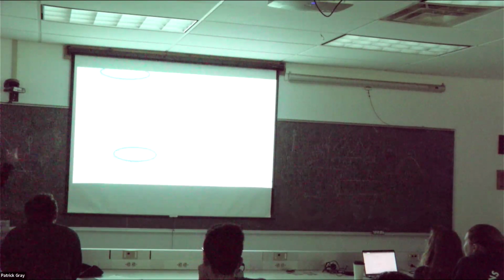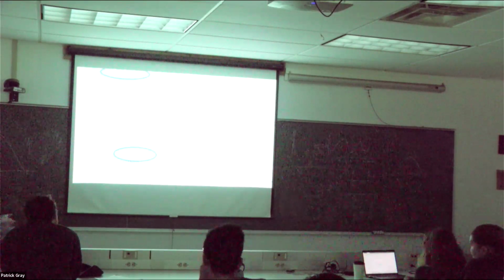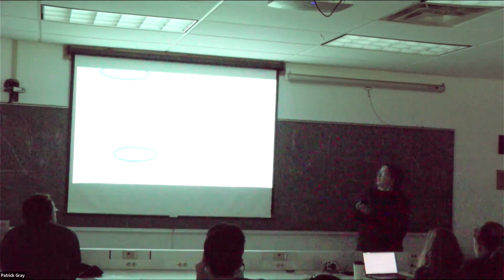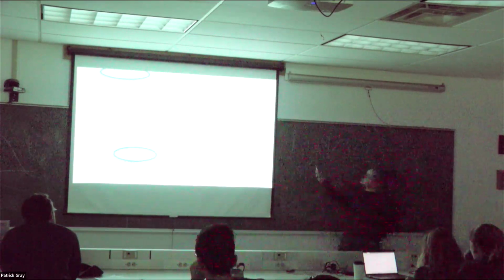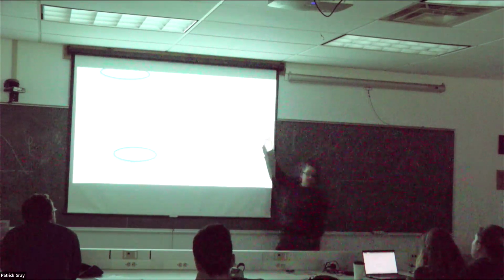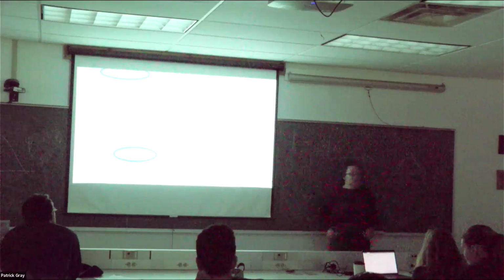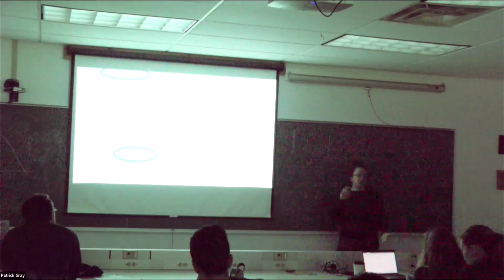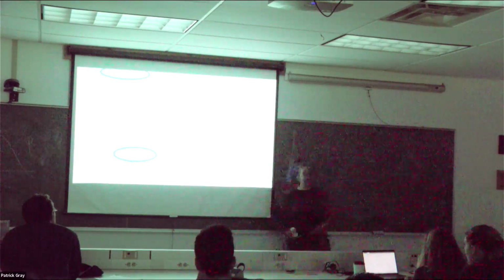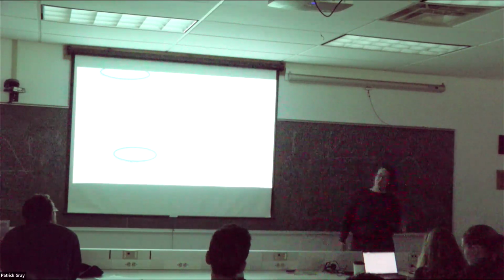However, I said that there are other chlorophylls in there. I really don't care about the other chlorophylls. We kind of do, but we really want to know about chlorophyll A. And going back to that spectra that you were shown this morning of the backscattering, we're talking about some shoulders around it. And these shoulders might come from the fluorescence of chlorophyll Cs and chlorophyll Bs. They spread that shoulder. And depending on the phytoplankton structure in your sample, the presence of chlorophyll C and chlorophyll B will change. And that's not enough. In the same way that chlorophyll A degrades, chlorophyll B degrades, and chlorophyll C degrades. And all of them will still fluoresce. And they're really kind of not great.